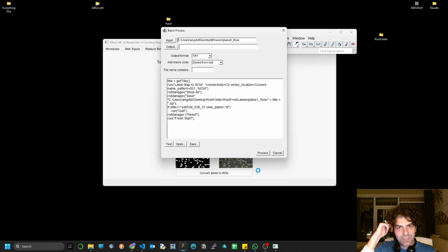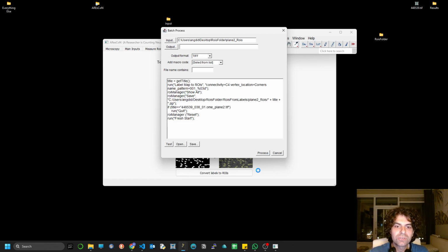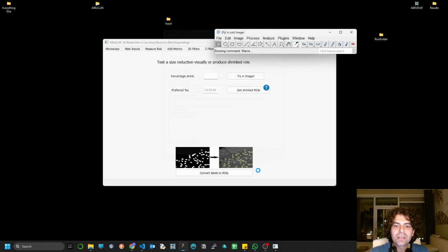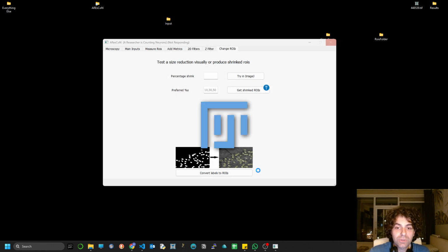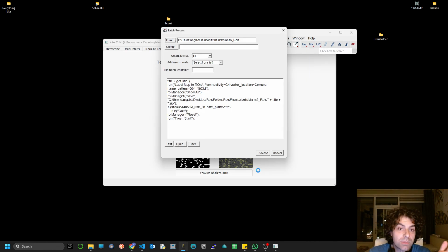Why? Because if you do so, when you finish with all the files that you have in one plane, it's a good signal to AResCoN that, you know what, I'm done right now, so you can continue with the next batch. This might not be the perfect way, but it's a way that works sufficiently, and after all, it's a matter of a few seconds till you open Fiji again and you type the command, and imagine that you're going to have 9 or 10 planes, let's say, right? So really, the repetition of the Fiji turning off and on is not going to cost you any significant time.